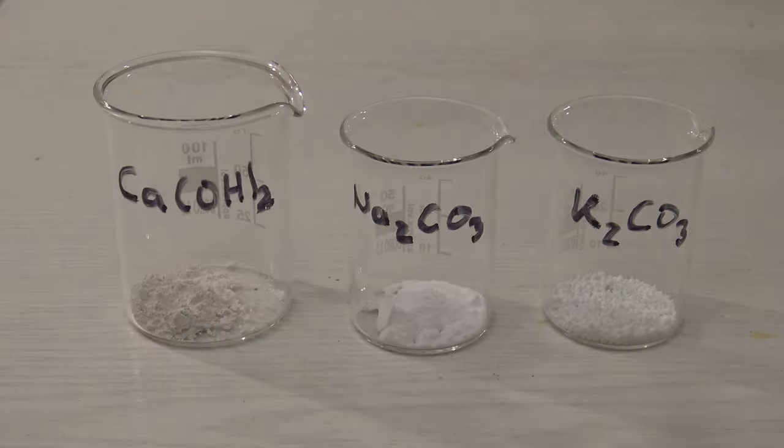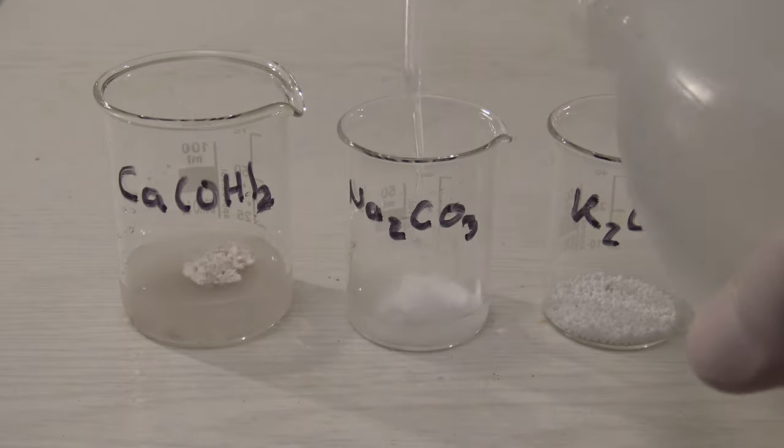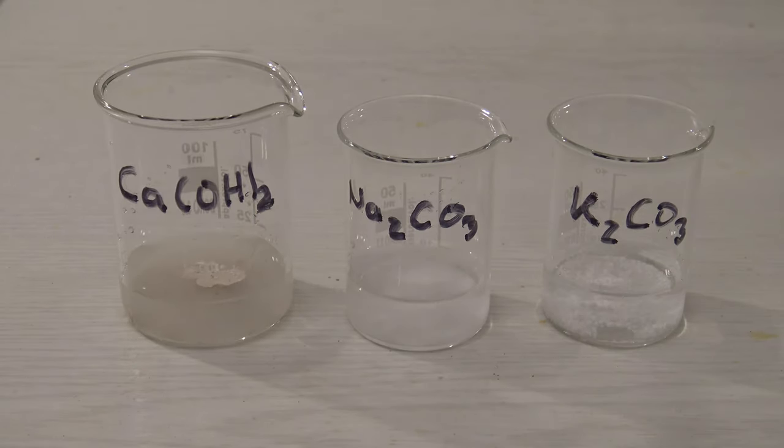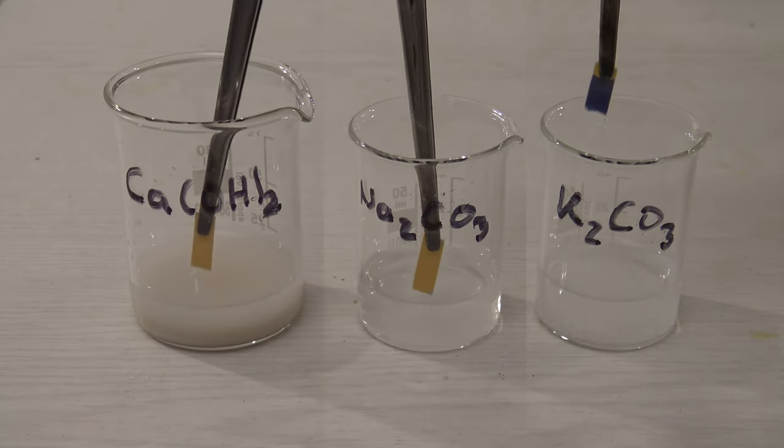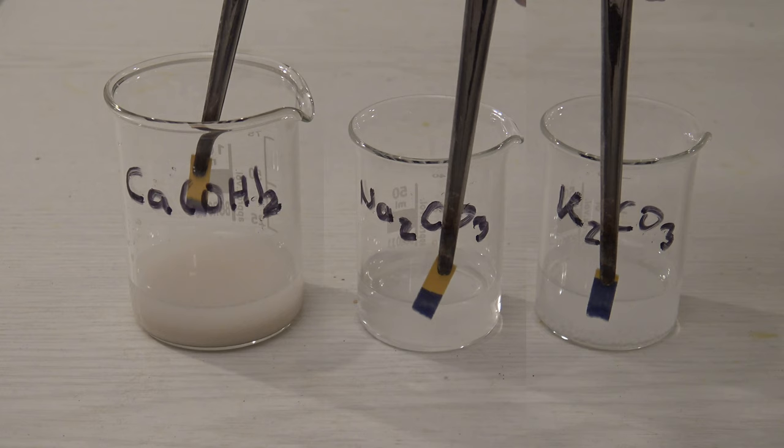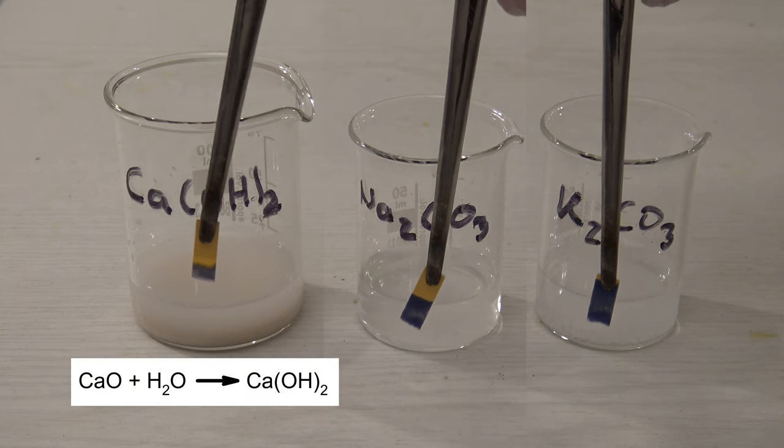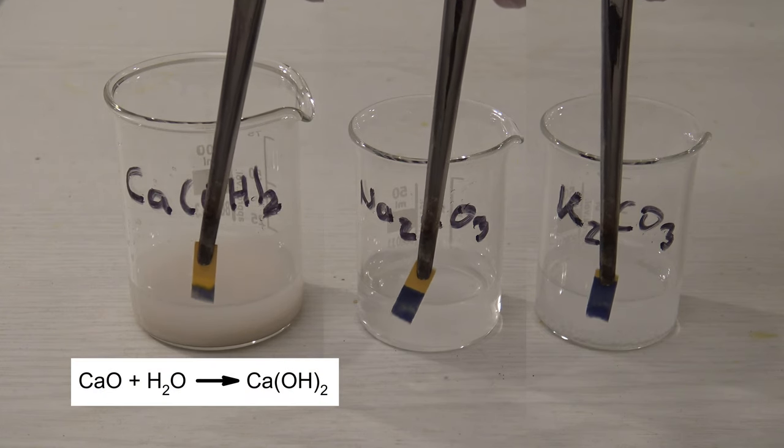The ash of plants consists mainly of the carbonates and oxides of calcium, sodium, and potassium. Except for the calcium carbonate, all of these cause the solution to become alkaline. The calcium oxide reacts with water to form calcium hydroxide at first.